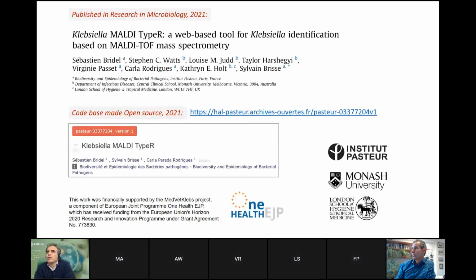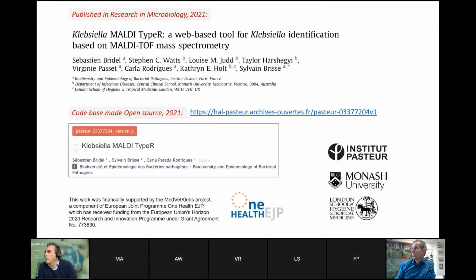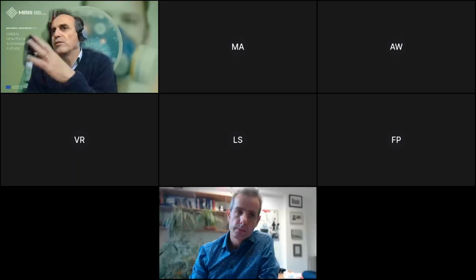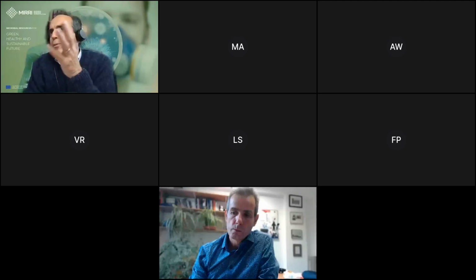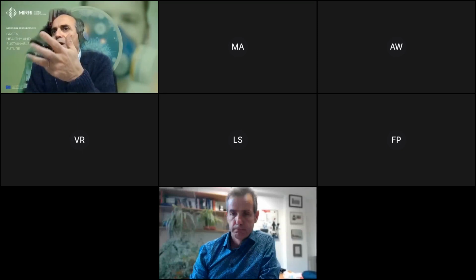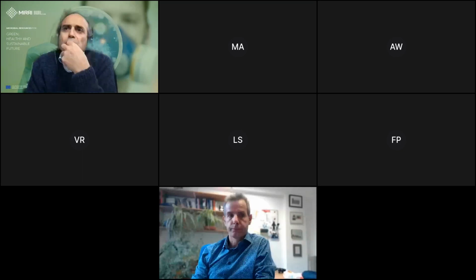Thank you, Sylvain, for this nice presentation of this very nice tool. And I hope that people will have questions. But my immediate question was about how generic it is. Because you have chosen specific markers, how far can we expand? Should we choose other markers for other genus, or could we look at the same orthologous markers in other genus and keep on expanding the database? That means it would not be only a Klebsiella typer, but a wider tool for species identification.